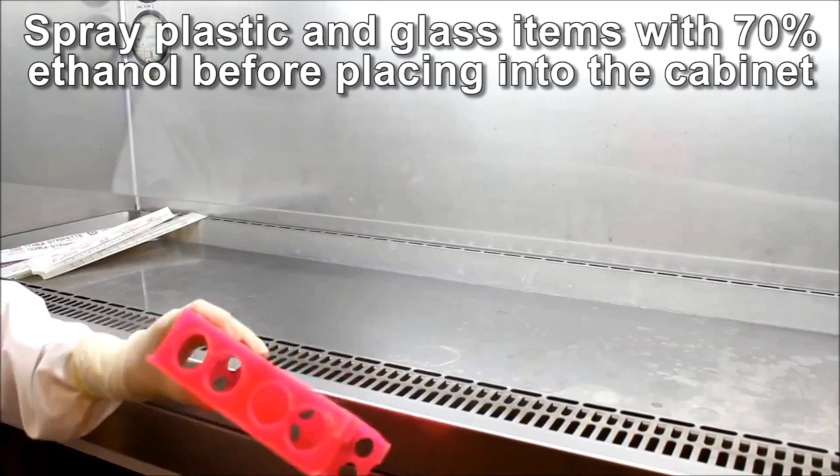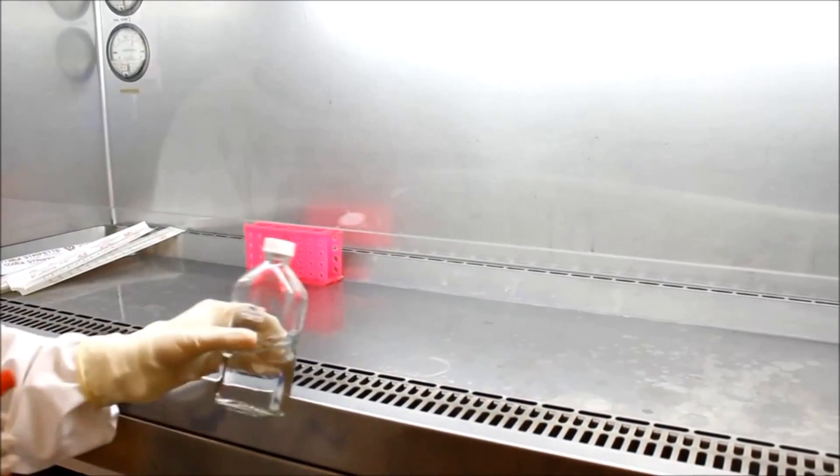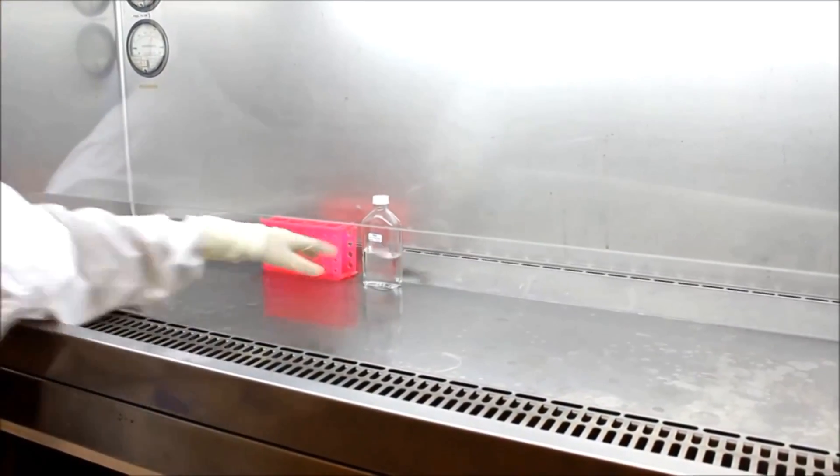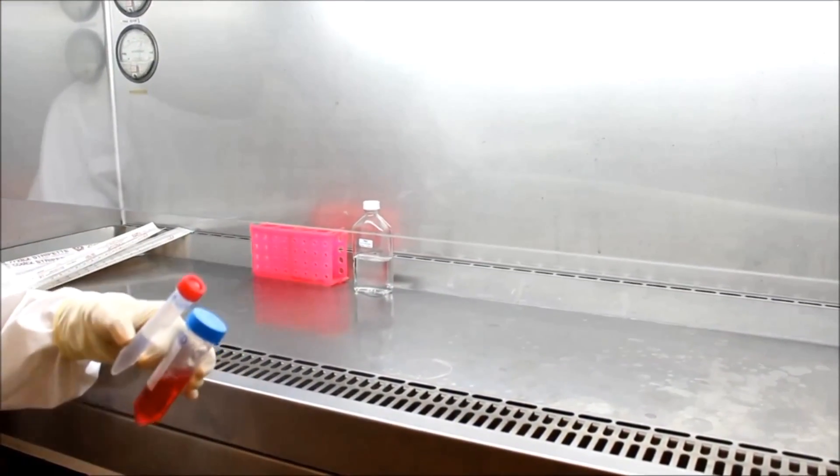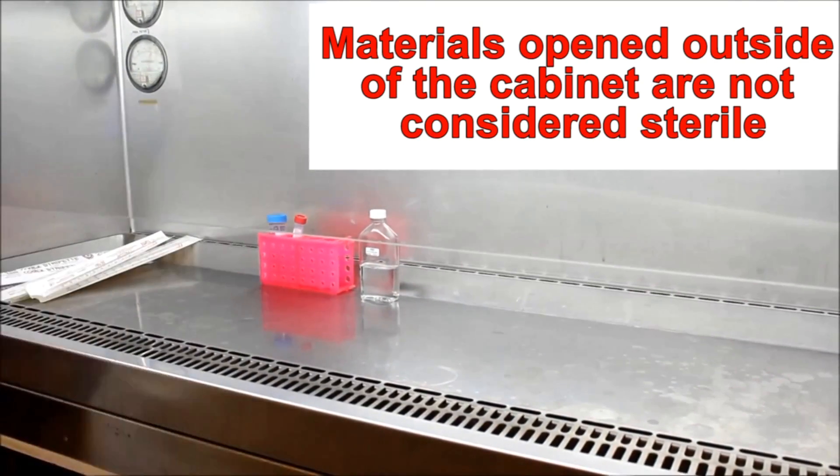Spray plastic and glass items with ethanol to sterilize them before placing them into the cabinet. Make sure lids are secure and that bottles have not been opened. Materials opened outside of the biosafety cabinet are not considered sterile.